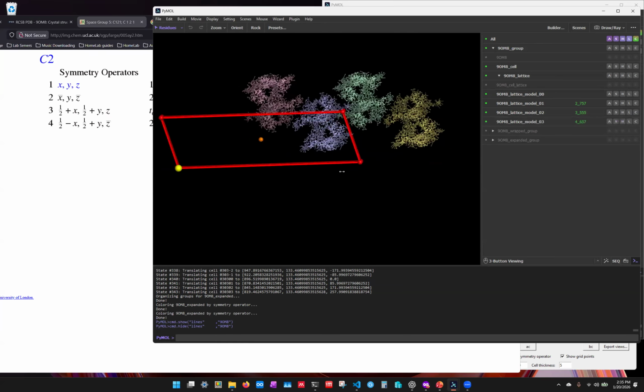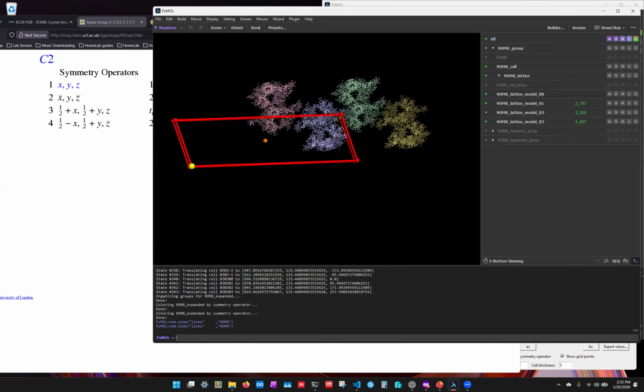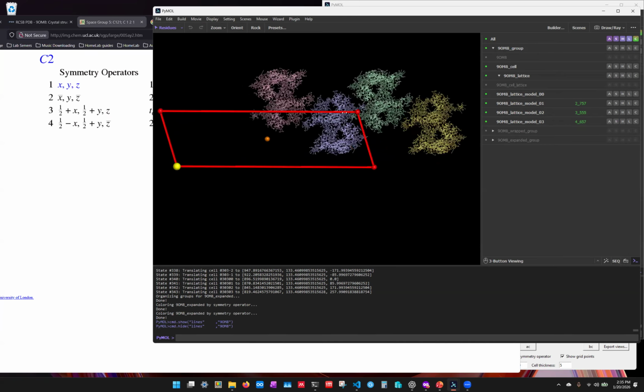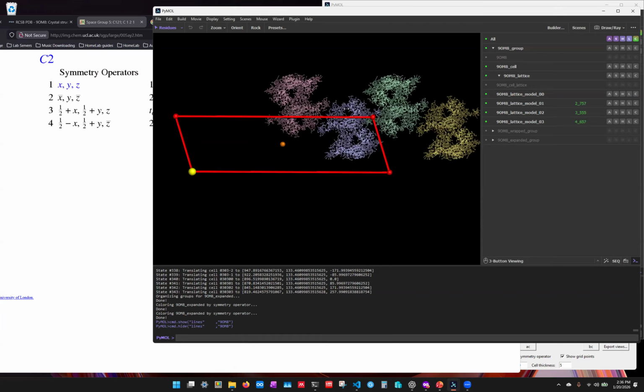Okay. So now we have a full description of the unit cell. Like you said, it still looks like it's outside of the unit cell, which I can see how it would fit into the unit cell if it were to be moved. Has anyone played those really old school Nintendo games, a platformer, where when you run off one end of the screen, you appear on the other end? If you picture that happening here, the atoms that are coming out of the unit cell just appear on the other side. So we can do that transformation.